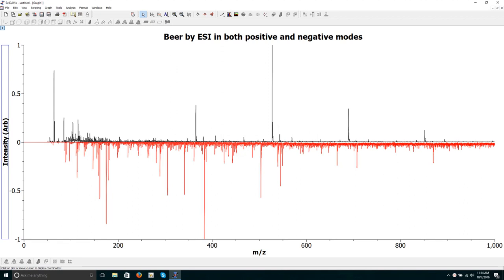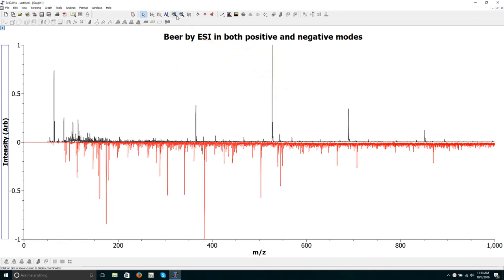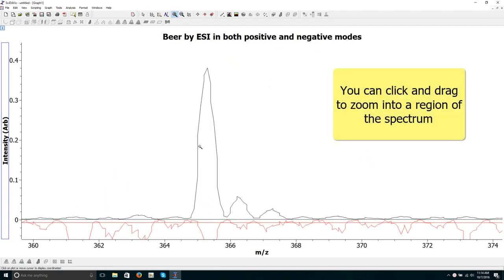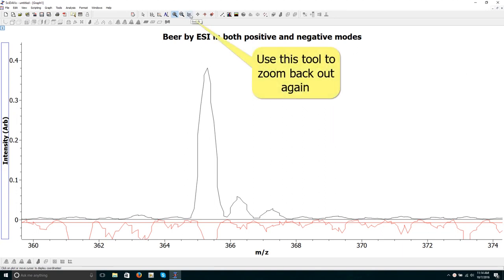How to zoom into the spectra: use this magnifying glass tool. You can click and drag to zoom into a region of the spectrum. Use this tool to zoom back out again.